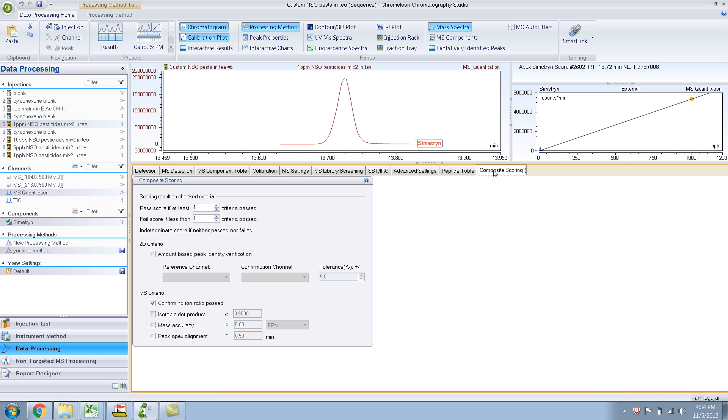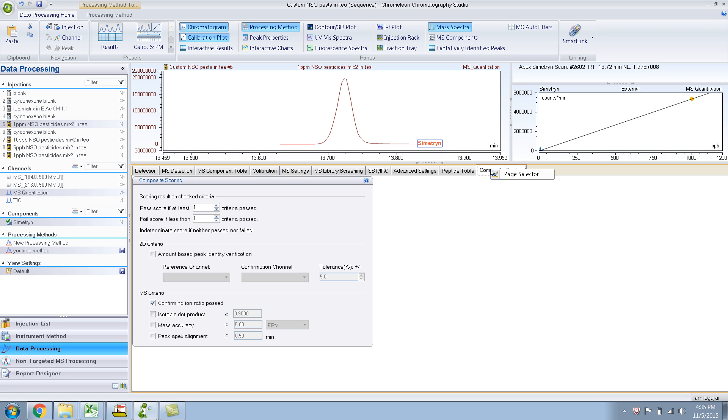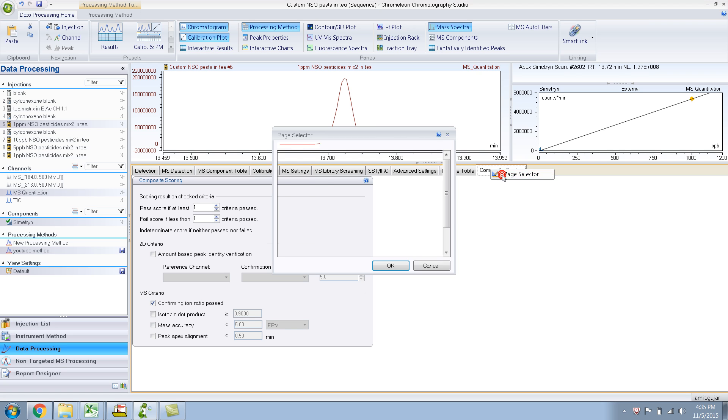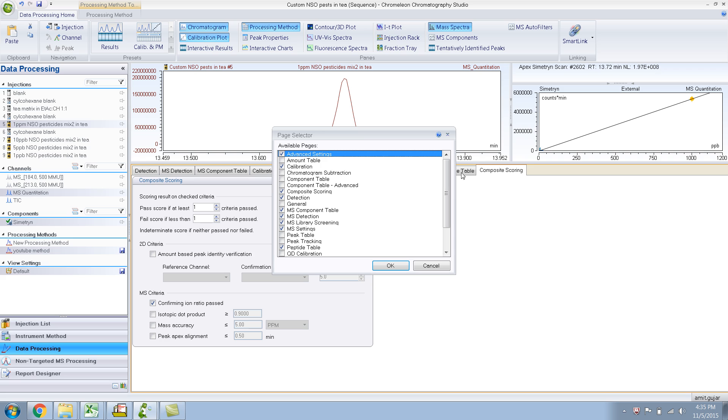Right now I'm in the processing method pane. There are a few more options. You just right click over here and give page selector. Go to page selector. You can see there are a few more other settings. Some of these are not relevant for GC-MS, but they're relevant for LC and IC.